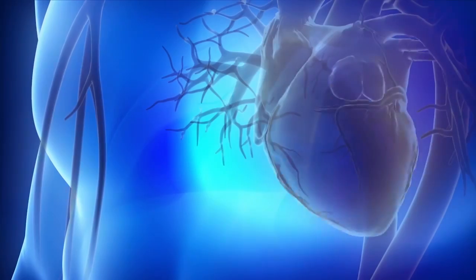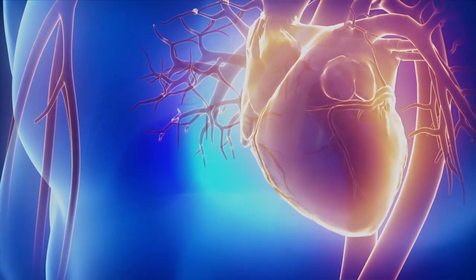The human heart, perhaps, is the only good model for perfect biological transfer. Until now.